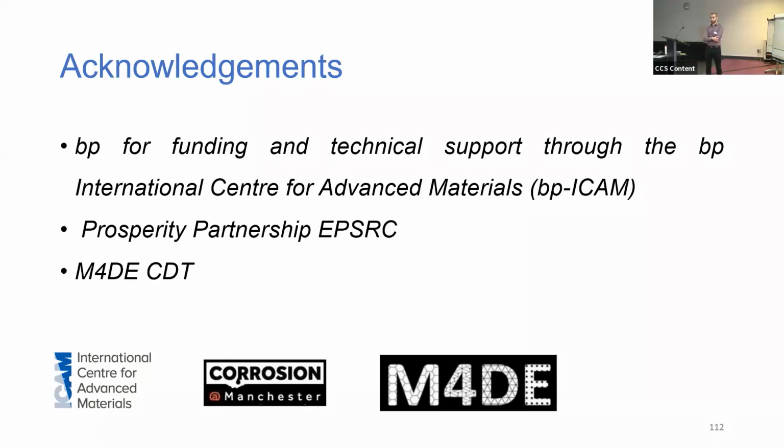Hi, thank you for that. I had two quick comments. One was the same as Beatrice, which is you should really do some scanning Kelvin probe in the AFM. And don't be frightened of it. It's simple. If that machine you have does phase contrast, you can run that. Go read Martin Stratmann's papers to work out what it's telling you. And it will take away all these questions about what you're looking at chemically in the system.